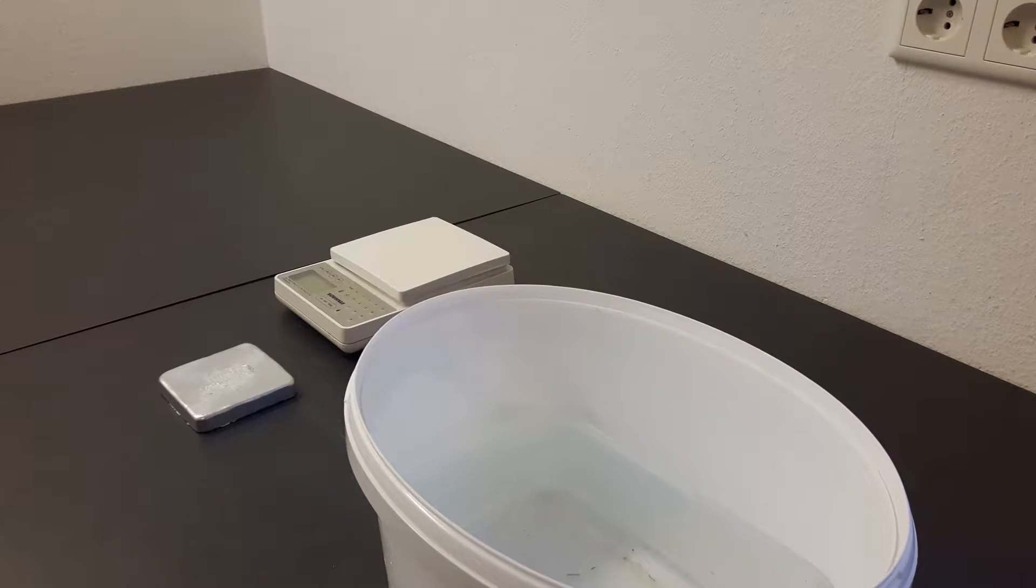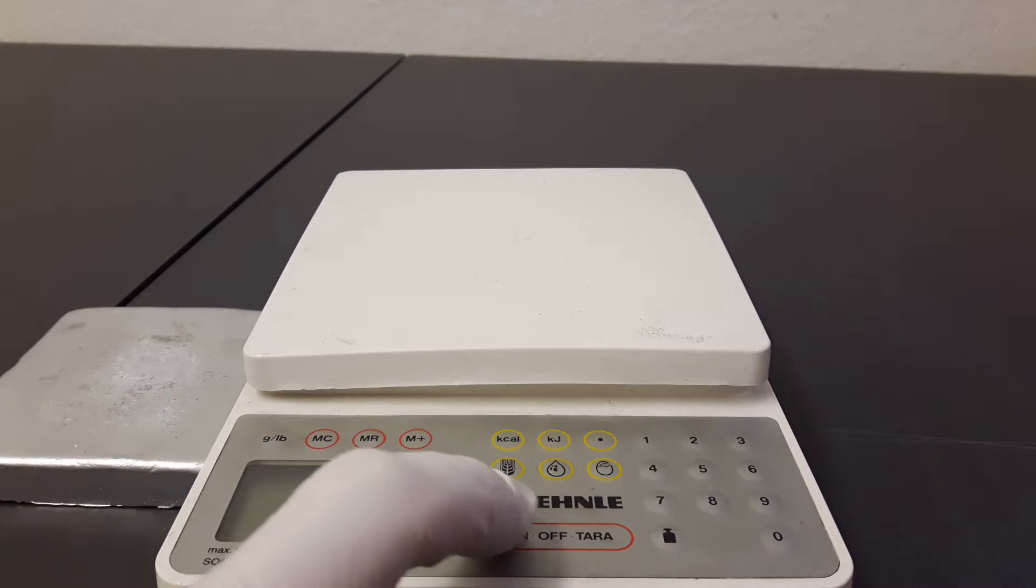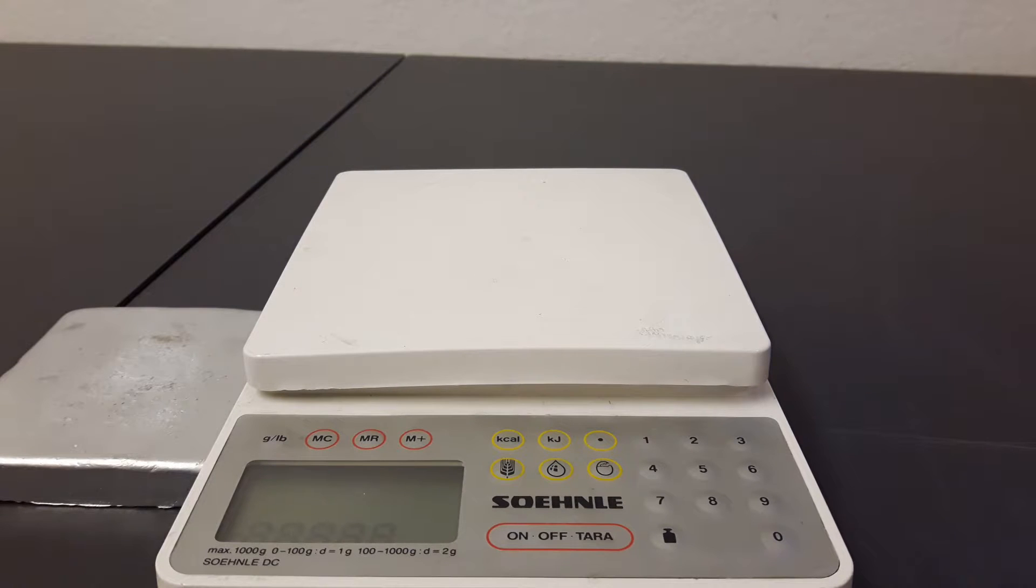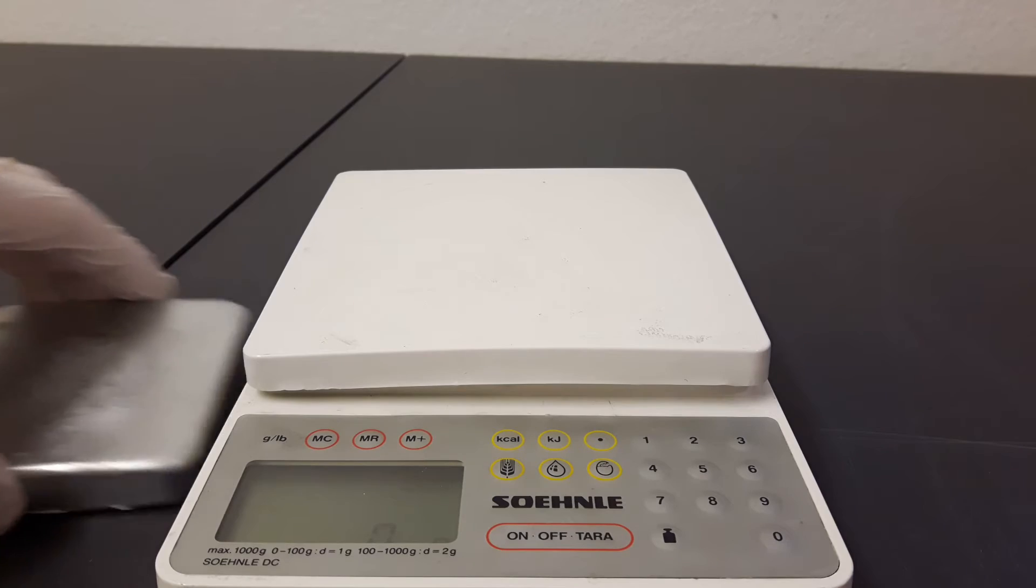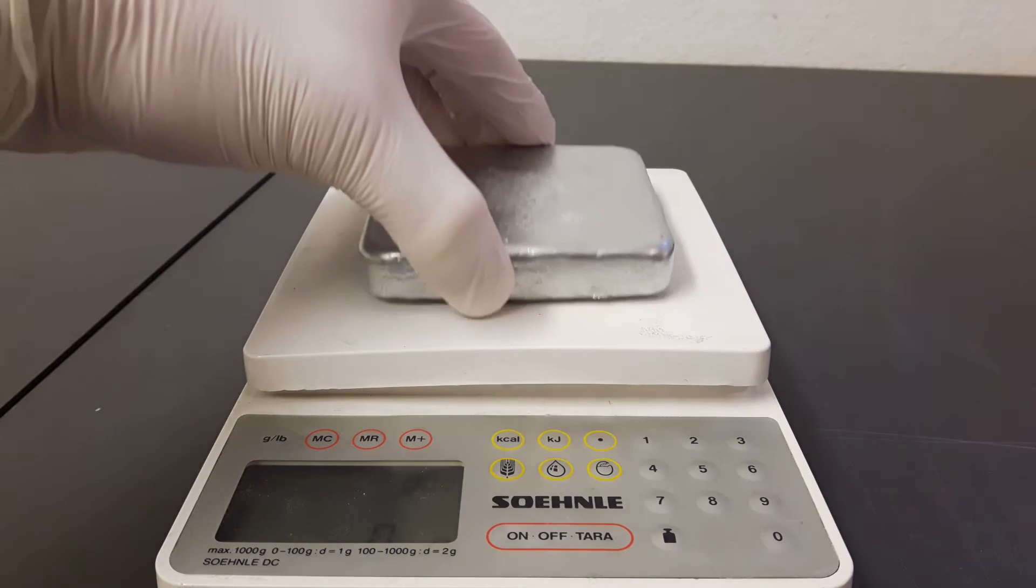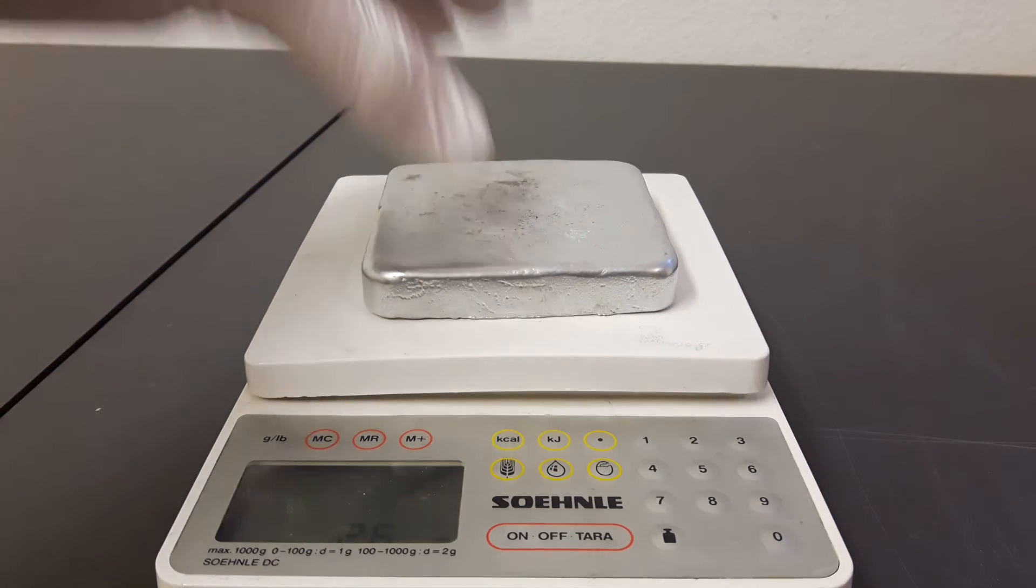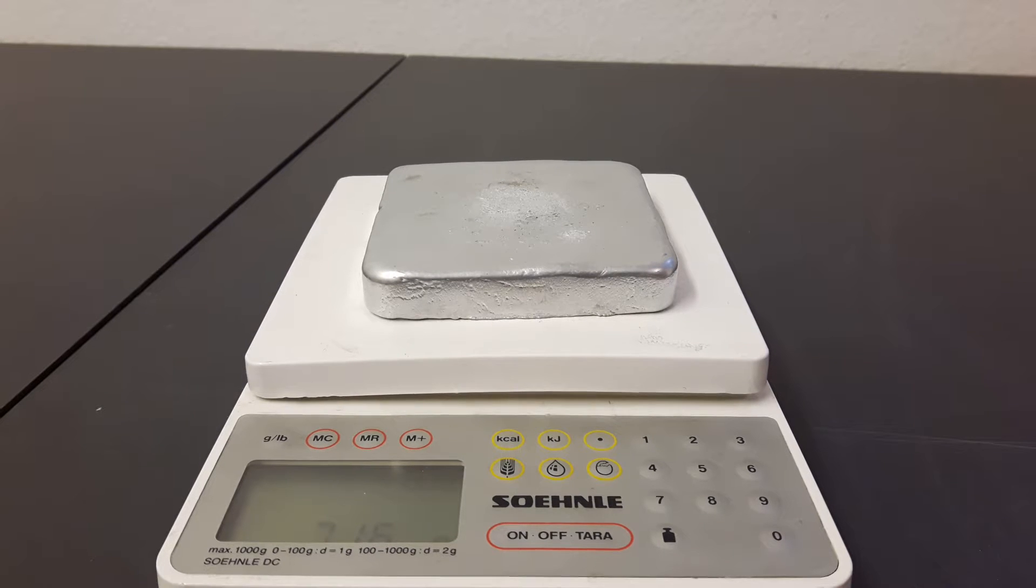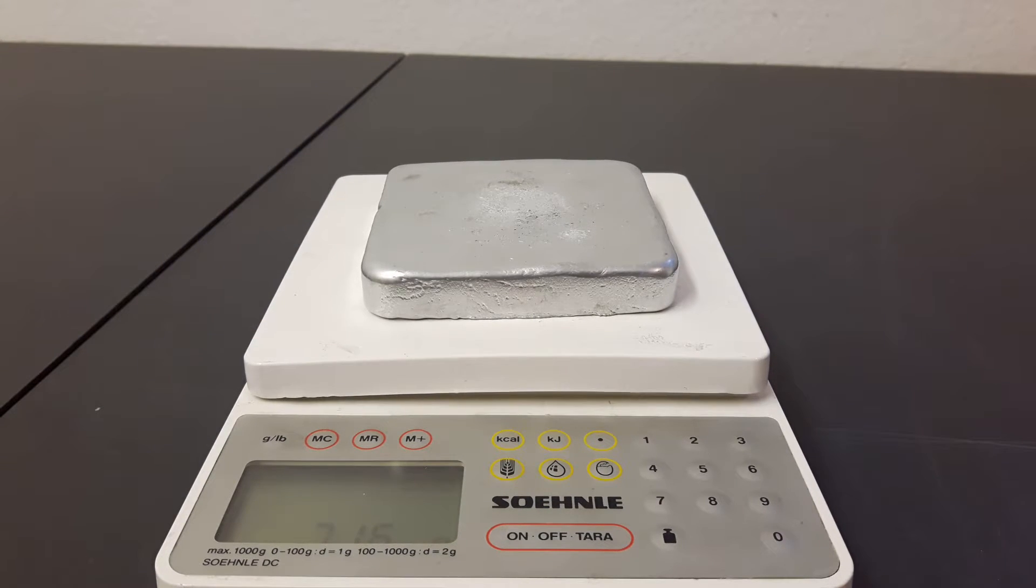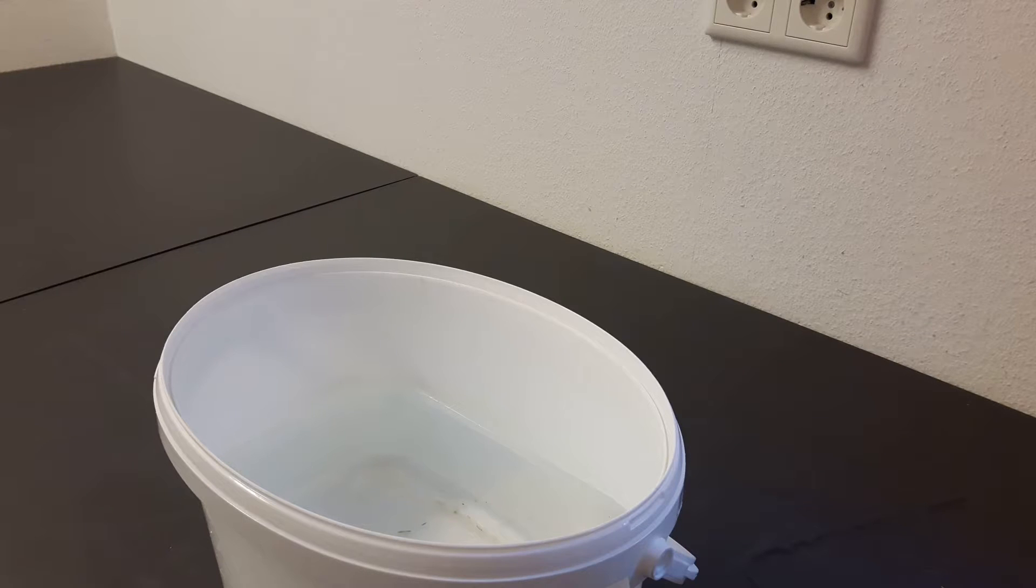To determine the density, I first weigh the zinc ingot and it turns out that the ingot is about 716 grams. Because the ingot is not perfectly square and the edges are round, I cannot measure it precisely.